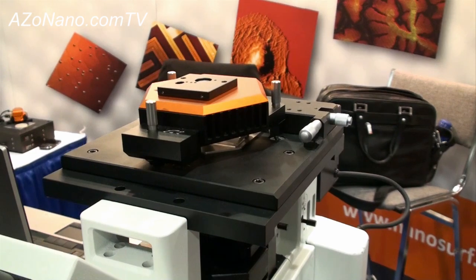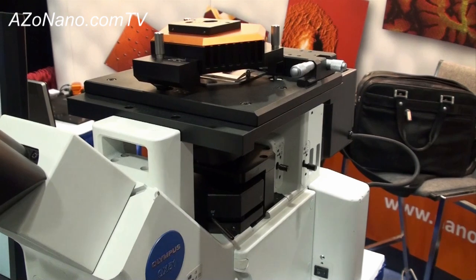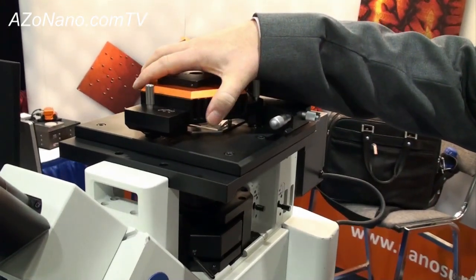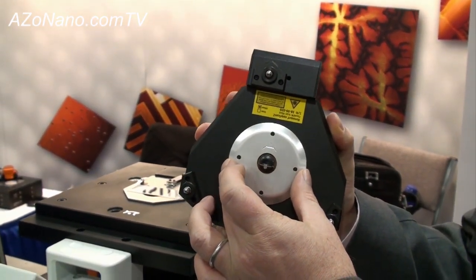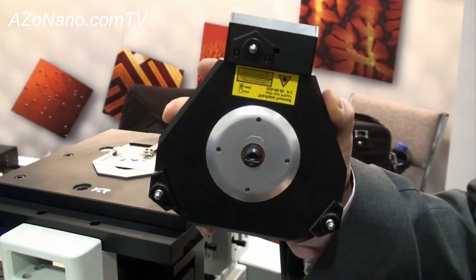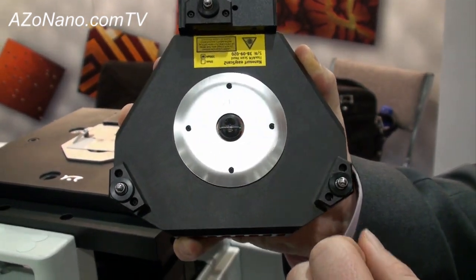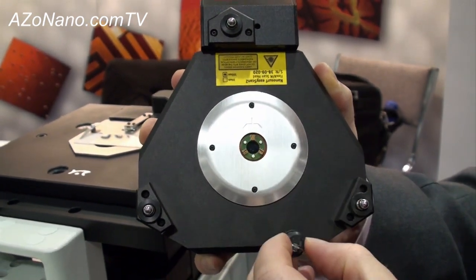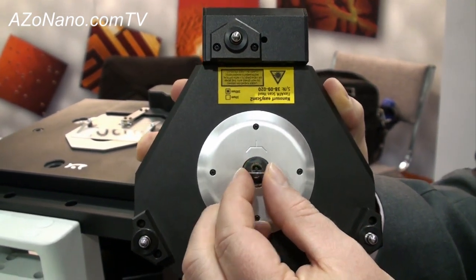This system differs from our older EZscan models in a few different ways. The scan mechanism for this system utilizes a flexure stage so that it scans in XY, and minimizes background movement that you might have with a standard tube piezo or tripod. It also utilizes a decoupled Z-Piezo to track the topography in the Z-direction. The cantilevers are mounted at the end of this Z-Piezo, and the Flex has interchangeable nose cones that may be used in air or liquid scanning.